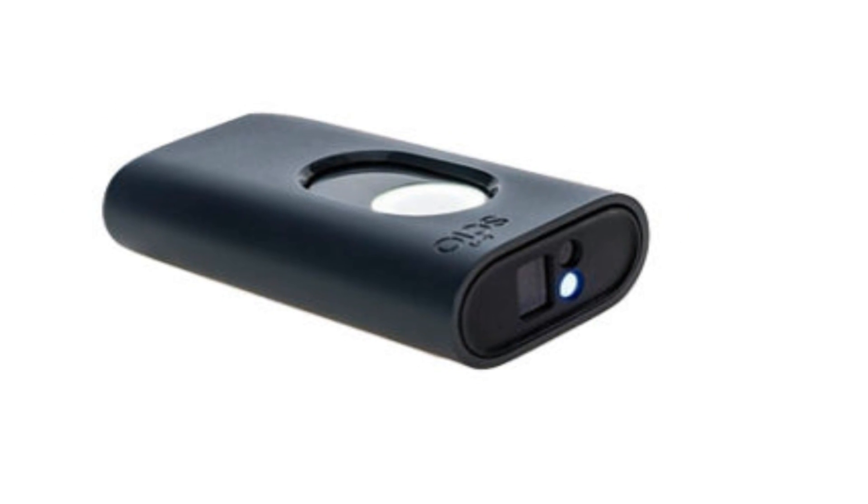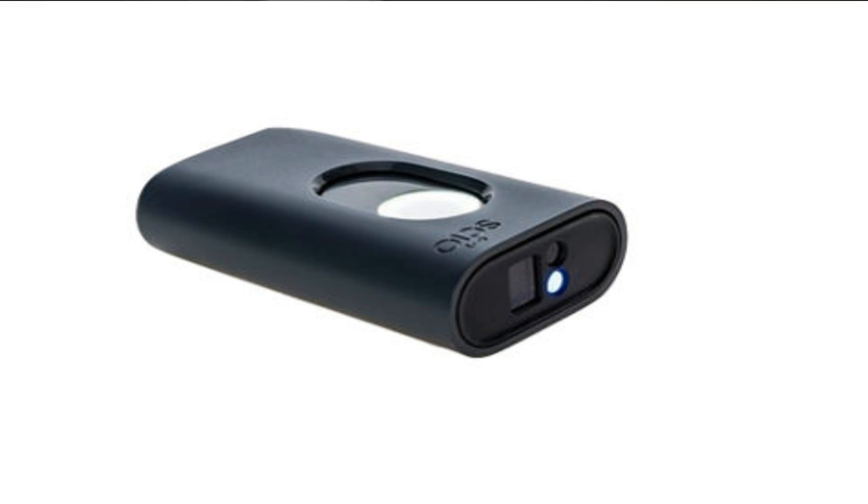I want to do a little video today on this funky new gadget I've just got. It's called a SCiO and it is a pocket molecular sensor made by a company called Consumer Physics, and you can buy it on their website at consumerphysics.com. It runs at about $299 American bucks.